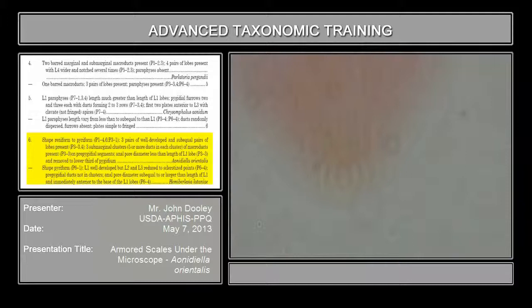Three pairs are well-developed and sub-equal pairs of lobes present. Sub-equal means they're about the same size. You can see it on the other screen too. Sub-equal doesn't mean they're equal size — it means that relatively, they do gradually decrease in size and length. If they're not sub-equal, these would be a lot smaller, maybe half the size. So, they're sub-equal in size.